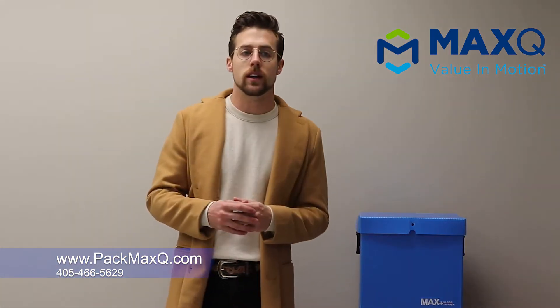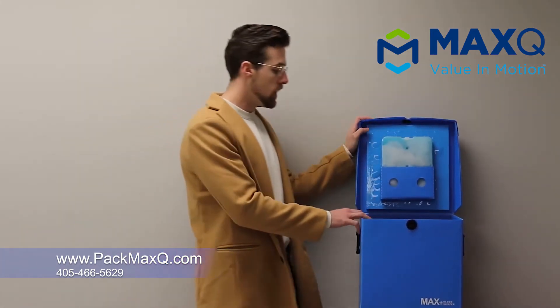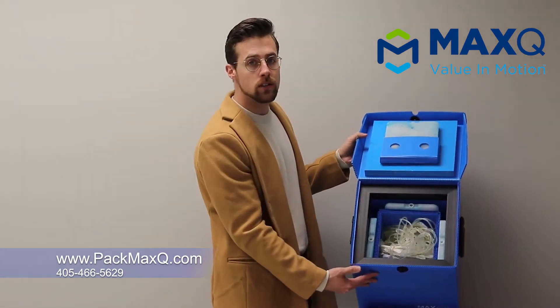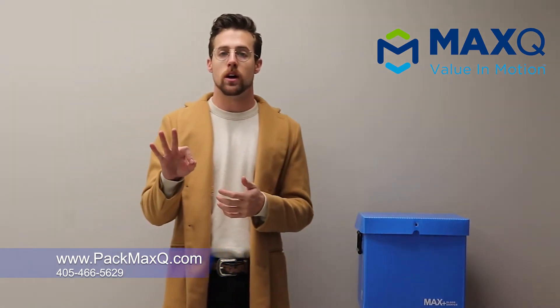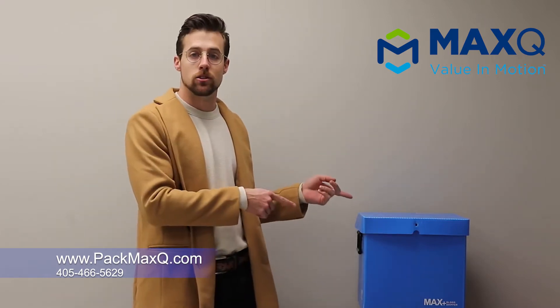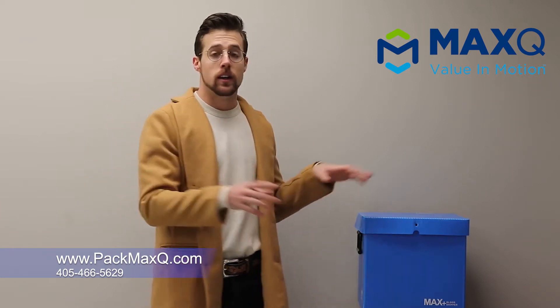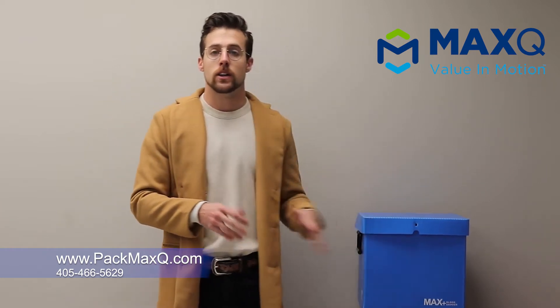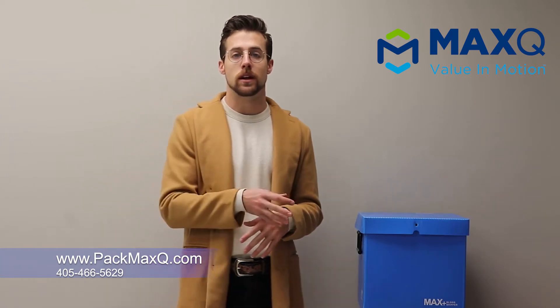The first thing I want to talk about is the sequence on how we pack our coolers out. What I have here is our R12MB. This is fully packed out — it has all the coolants and our payloads in it. What we do first is take our three frozen coolant bottles from the freezer and put them immediately into the cooler. The next step is to get your refrigerated coolants out of your refrigerator and place those in the cooler. It's really important that the coolants go into the cooler before the payload so that it can cool the system down prior to the payloads coming in.